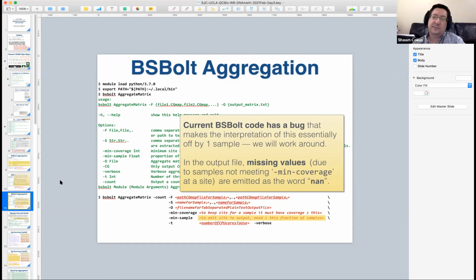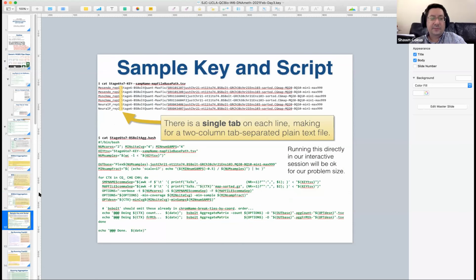It's essentially because it's rounding the fraction you give it downward instead of upward. And so this is basically a bug, because the way it operates doesn't make sense given the help language for this thing. In the code, if you dig it out, the line is wrong. It's rounding down instead of up. So that'll produce a little mess.